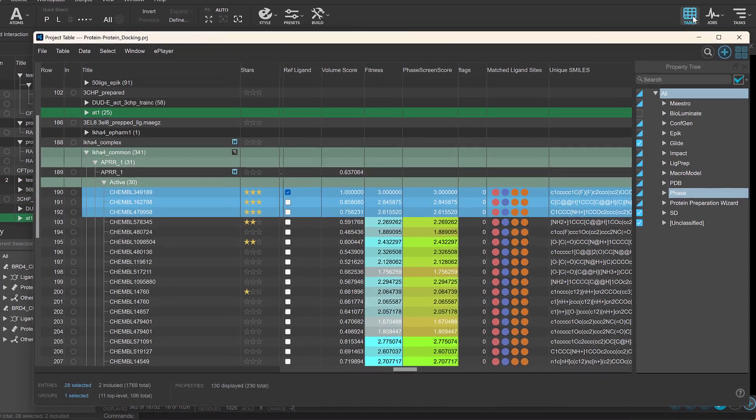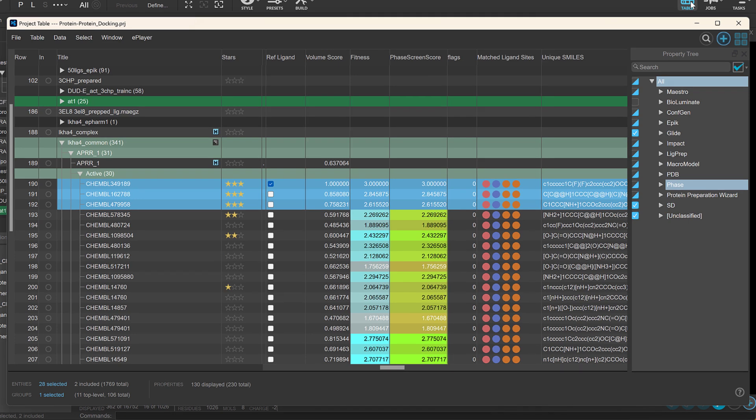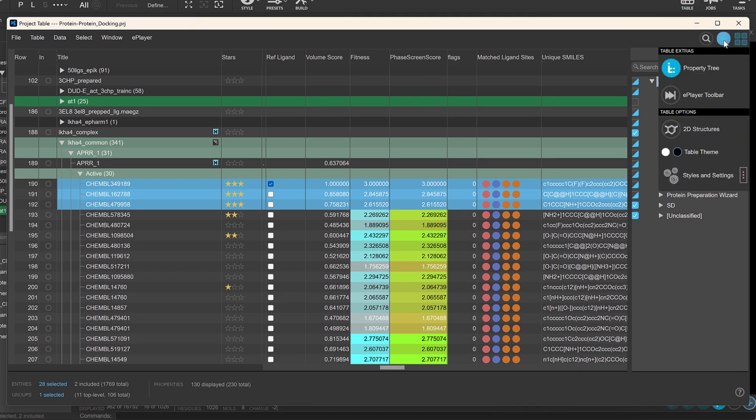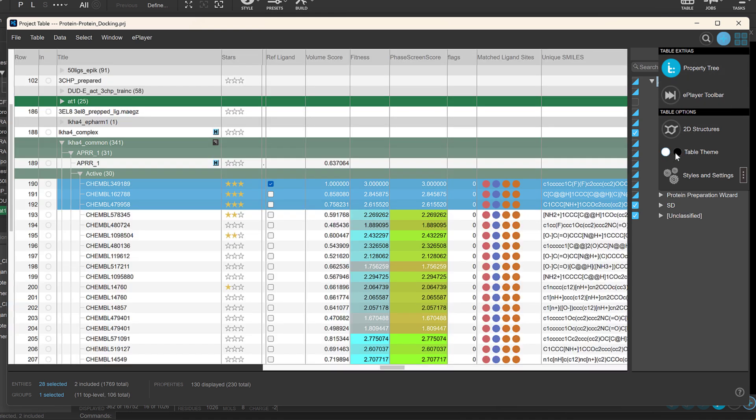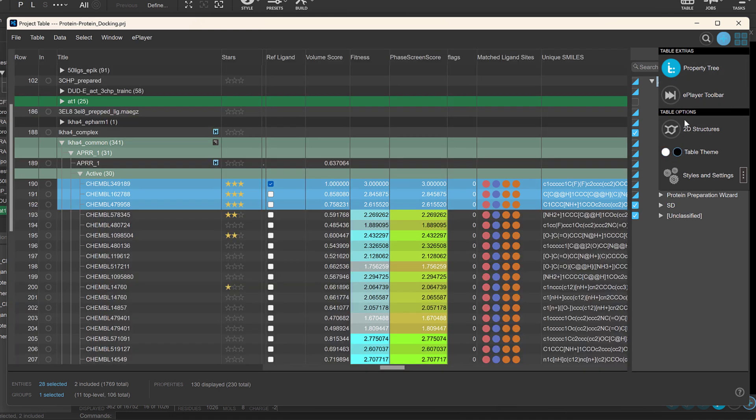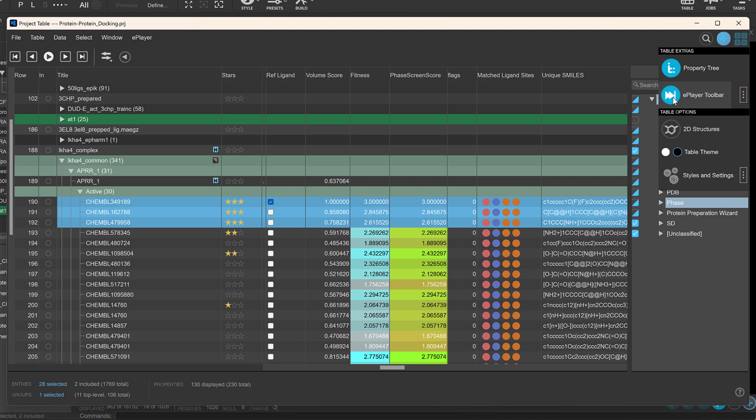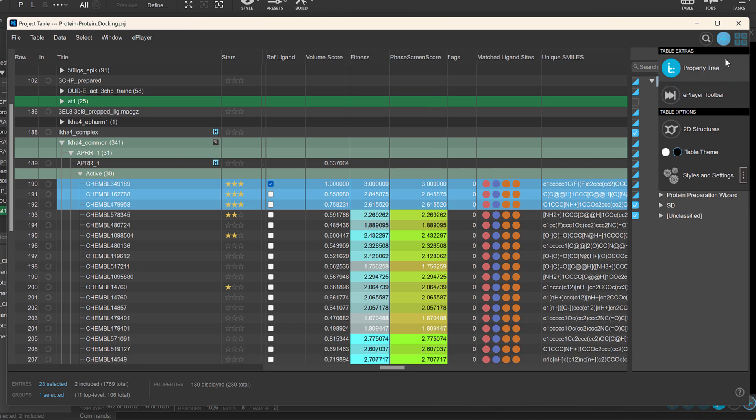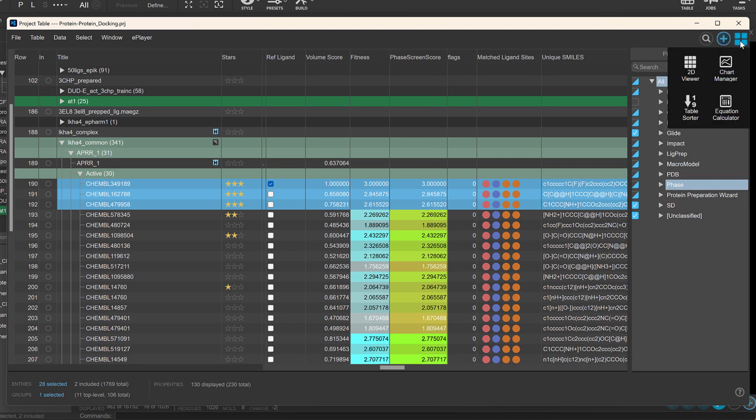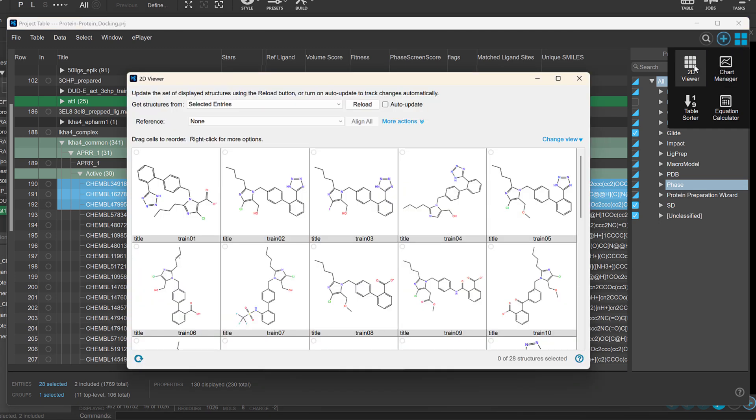We've also modernized and streamlined the project table for enhanced usability. This includes a new table configuration pane, allowing easy switching between light and dark themes and toggling component visibility alongside a new gadgets menu providing convenient integrated access to tools like charts and the 2D viewer.